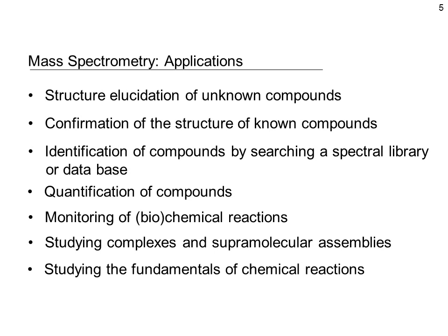An interesting application is the identification of compounds by searching a spectral library or database. We will hear about this in the field of protein analysis, but also small molecule analysis uses spectral libraries. This means essentially that the experimental spectrum is compared with thousands or even hundreds of thousands of spectra collected in a library online via the computer.